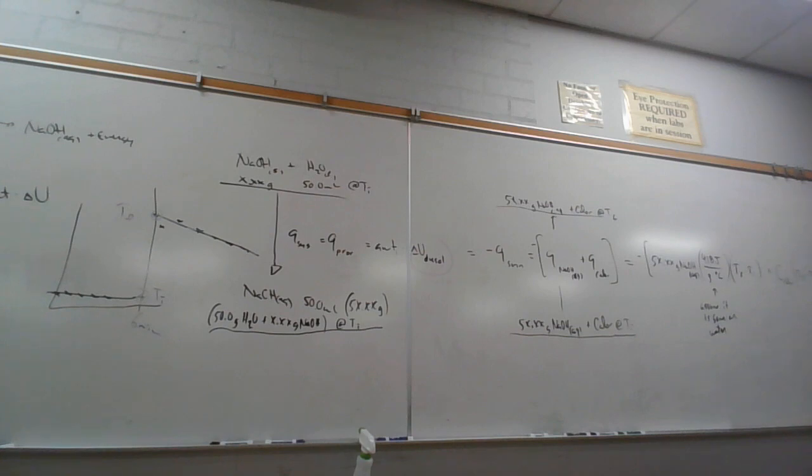What was the last one we did? Solid sodium hydroxide plus HCl. Yeah. So we did solid sodium hydroxide plus HCl. So this is going to be HCl aqueous plus NaOH solid. This should give more energy than HCl aqueous and NaOH aqueous, because dissolution of NaOH is exothermic in itself. And then we have the reaction, and so we should get more energy from this.